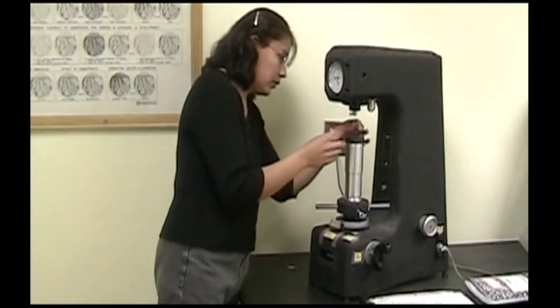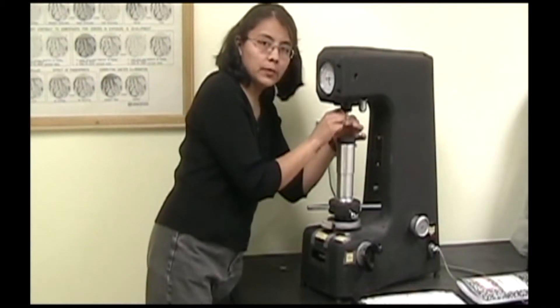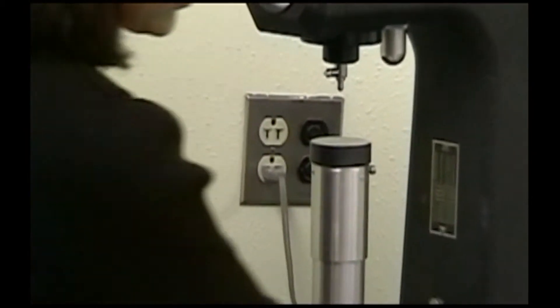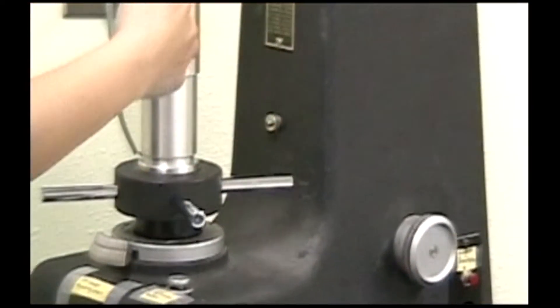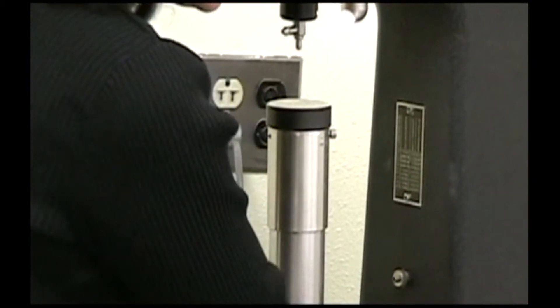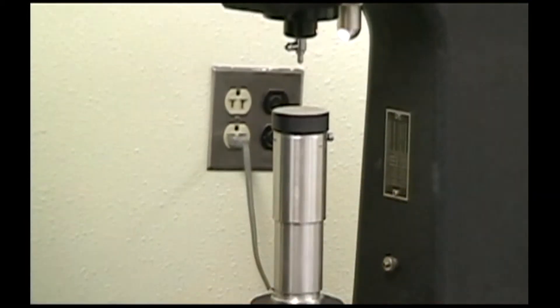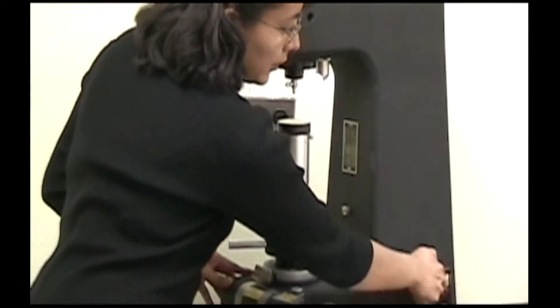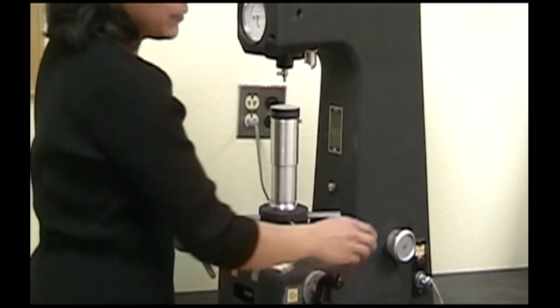You insert the indenter you'll be using and you can turn on the light here so that you can see better. You should also set the load for the indenter that you're using. You should set it on 100 for the Rockwell B scale and set it on 150 for Rockwell C.